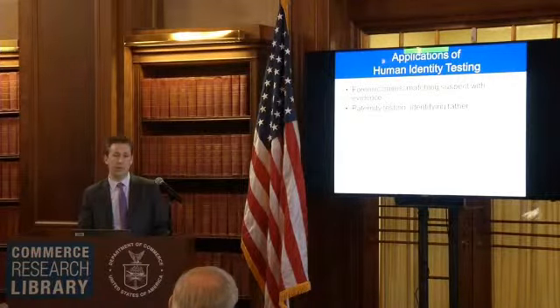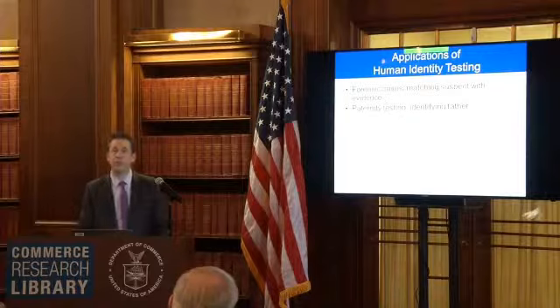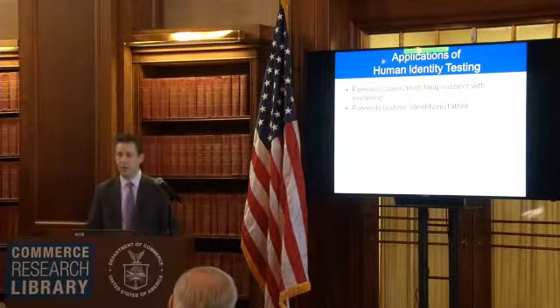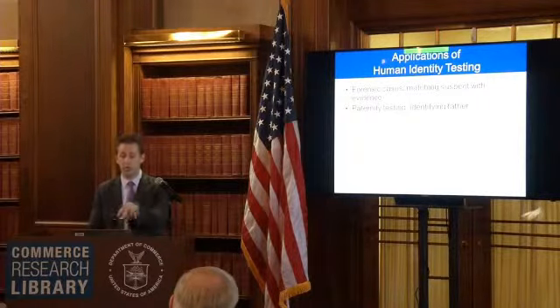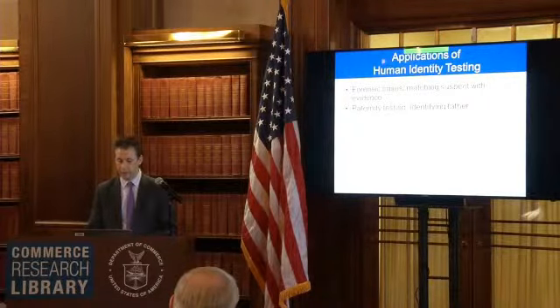Paternity testing, so if you have an alleged father in a case, you would type the child and the mother and then type the alleged father, and I'll show an example of this later, but see, does everything match up there in terms of genetic identity?